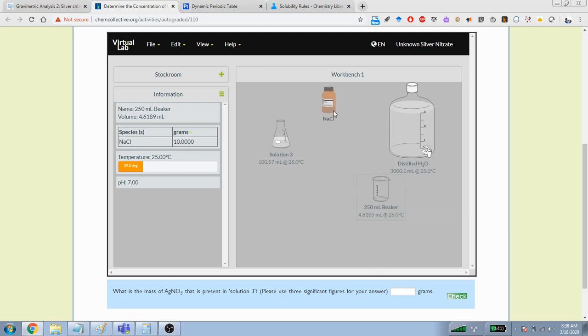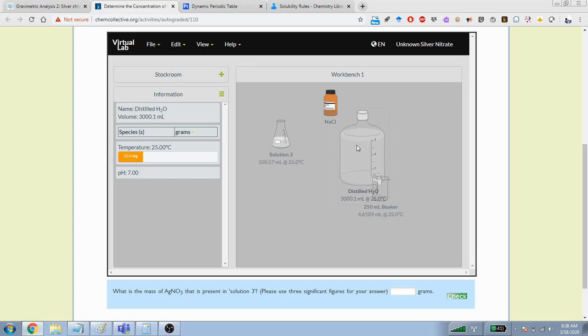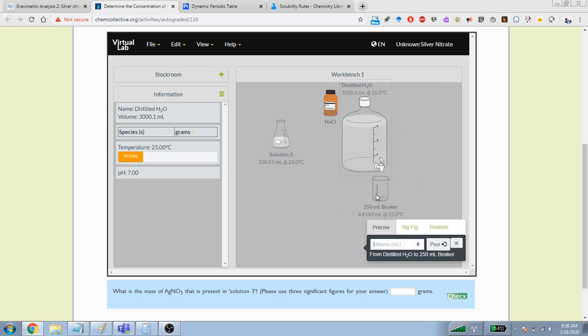Does it have to be 10 grams? No, of course not. It doesn't actually matter how much you put in there. You just have to have enough. So how do you know if it's enough? You just try it. If you end up with not enough, you do it again and you put some more. Right? So I'm just going to pour some water in here.